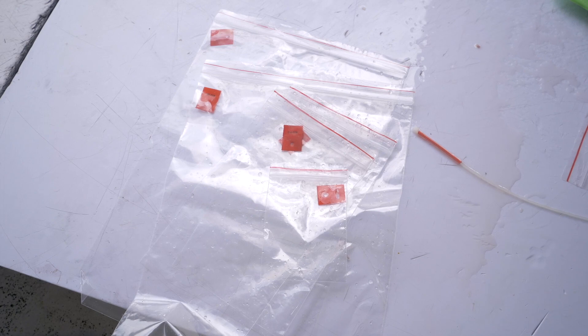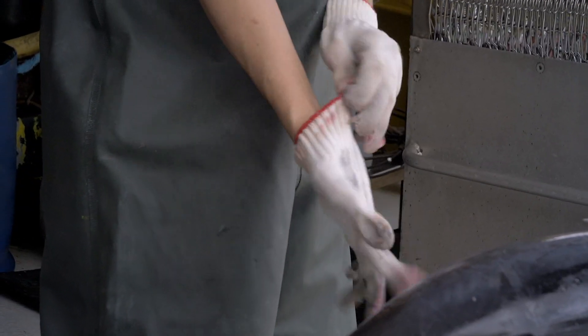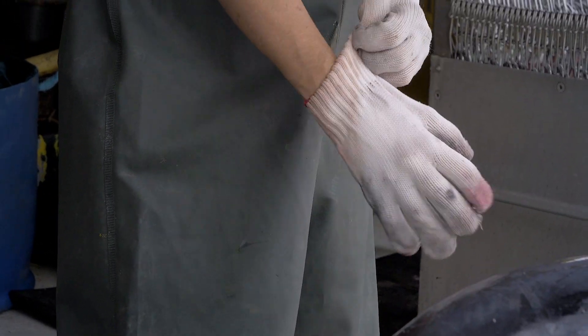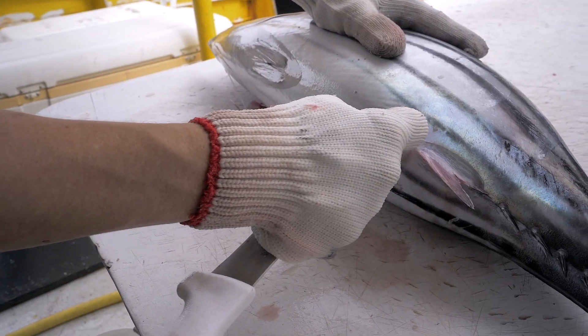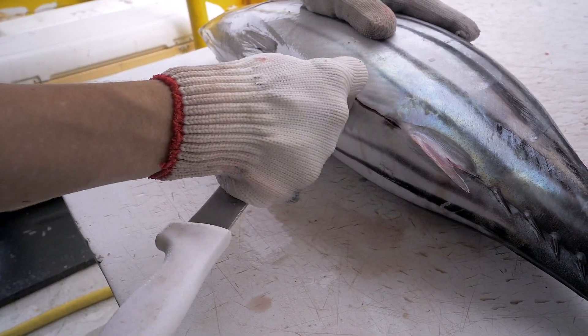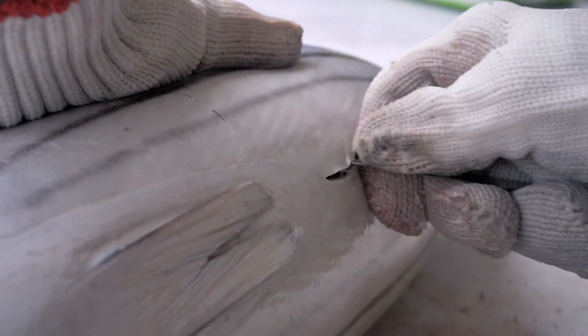I will demonstrate first the techniques that you can use on tuna with low commercial value. We are going to look at the internal organs together, because you need to be able to identify them to collect them. Use the tip of your knife to cut the belly. Be careful not to slice too deeply into the fish because you will damage the stomach.